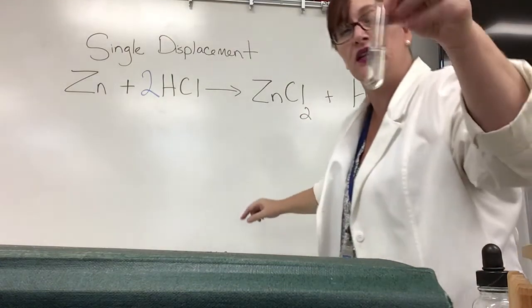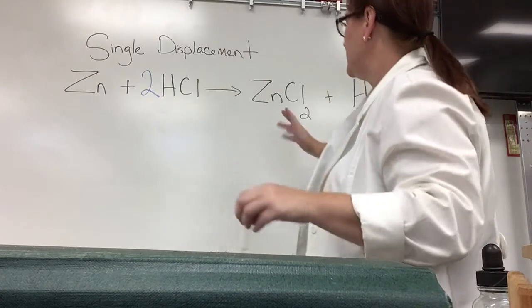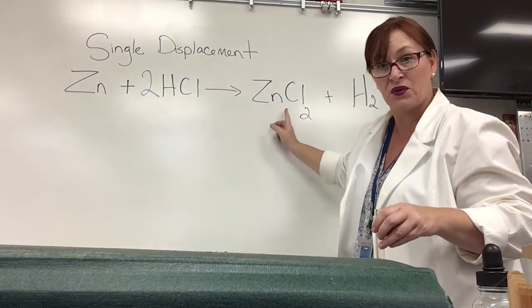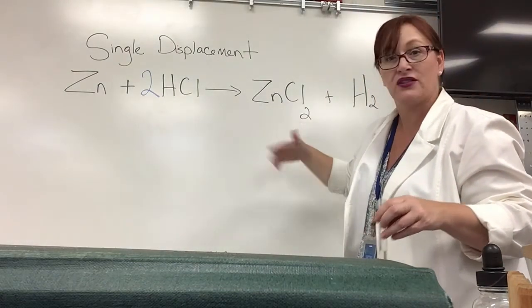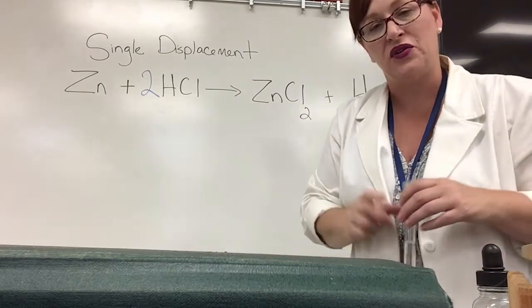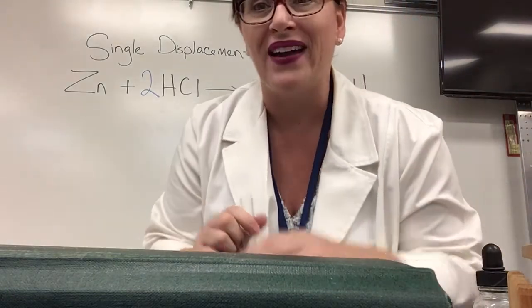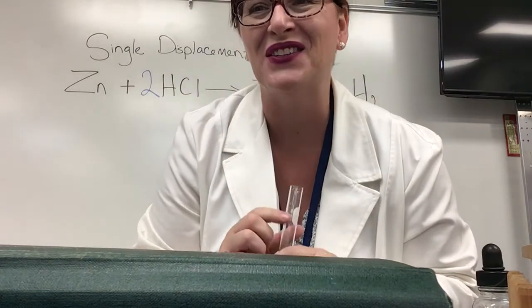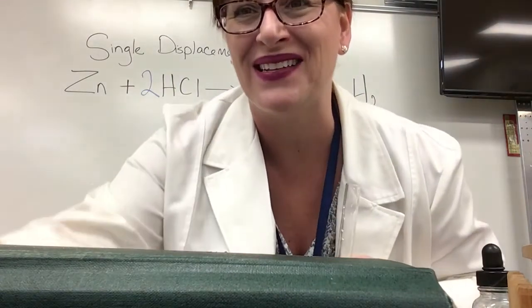So this clear solution that's in here is actually not water, it's a solution of zinc chloride and so that's just kind of like a salt and it's dissolved and you can't see it in there. So that wraps up our hydrochloric acid and zinc experiment. Thanks so much.